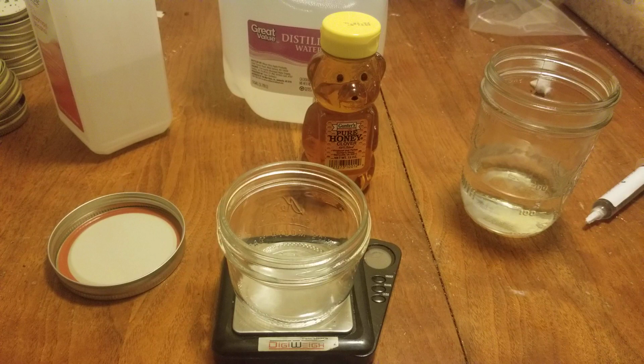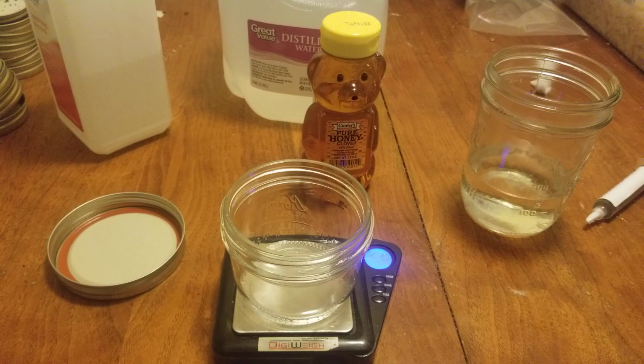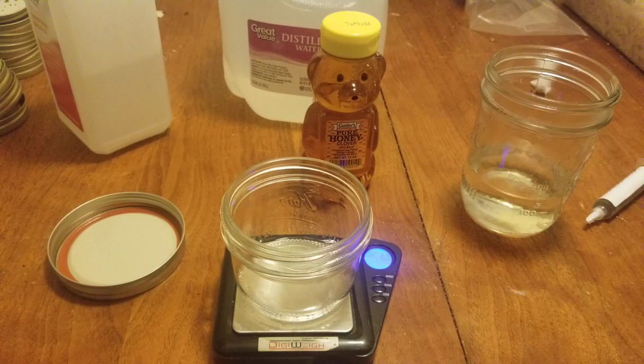So this is what we're going to start off with. My scale turned off for some reason. Let's turn that back on. Oh, and another thing that is recommended is something glass, like a marble. That will be used later on as our culture starts to grow. As the spores start to germinate, we will use that to mix it up. I don't have marbles here. I preferably use something glass as it doesn't have any metals in it. You could use a stir bar, but marbles are more readily available.